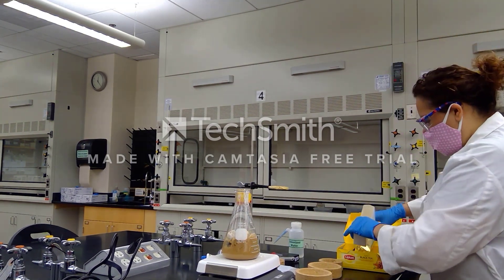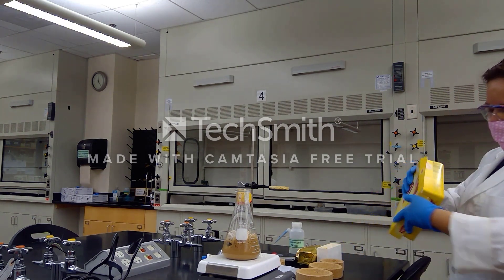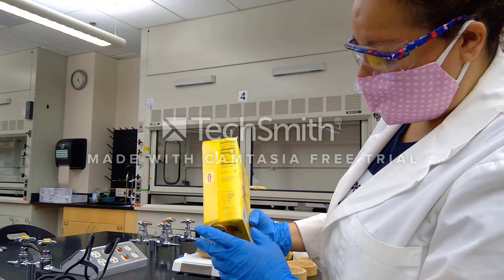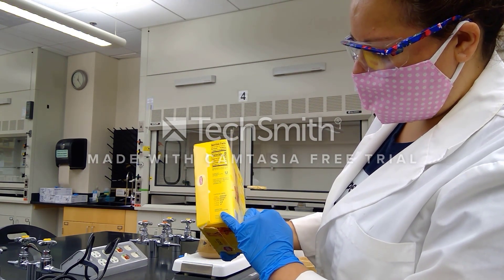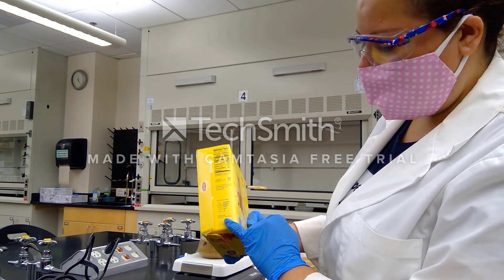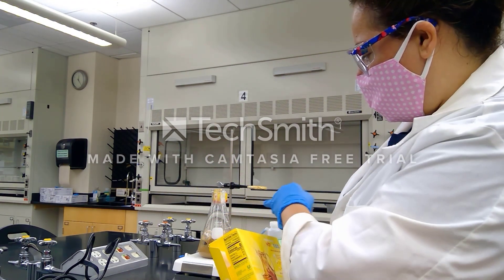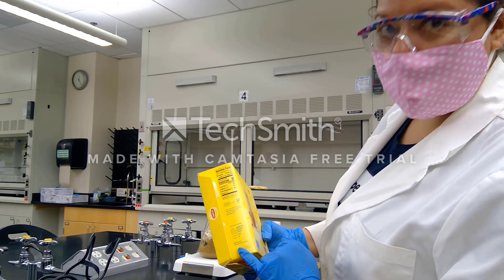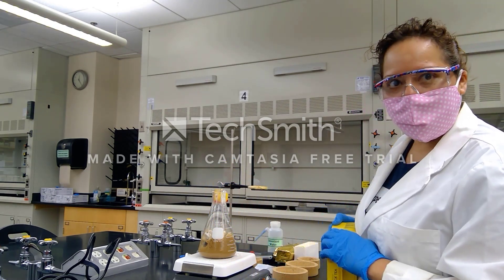While this is boiling I just want to add a little information for you. On our box of tea here we have some very important information you'll need to know. It tells us that we get 55 milligrams of caffeine per eight ounce serving. So for six bags here we would multiply those 55 milligrams by six. We will come back in a minute when our tea is brewed.